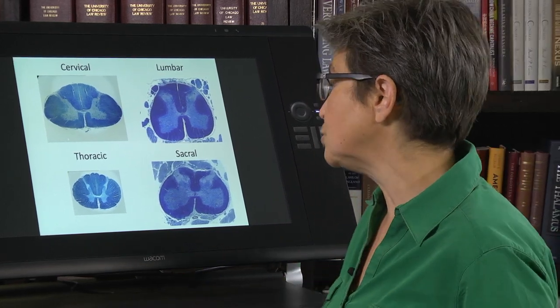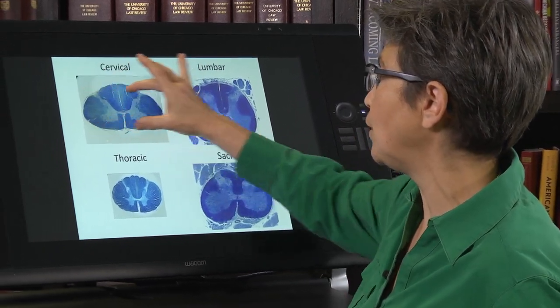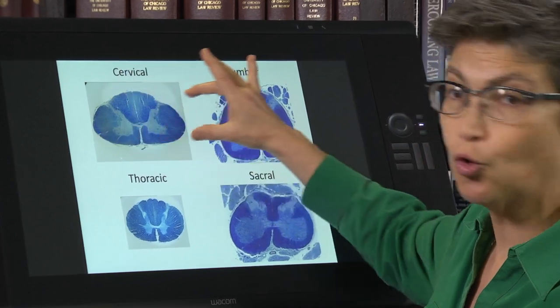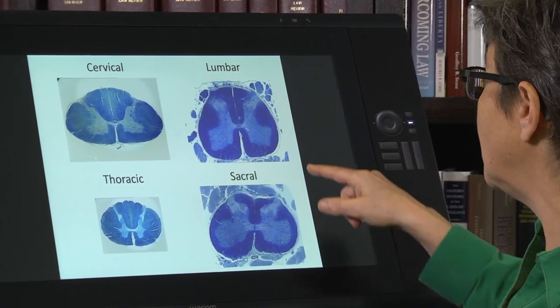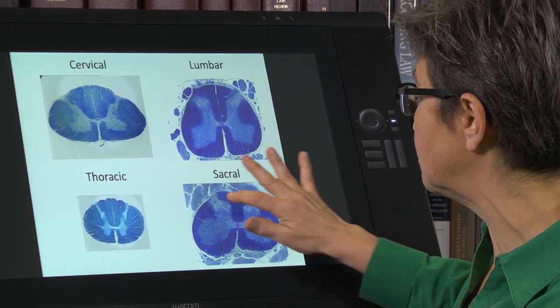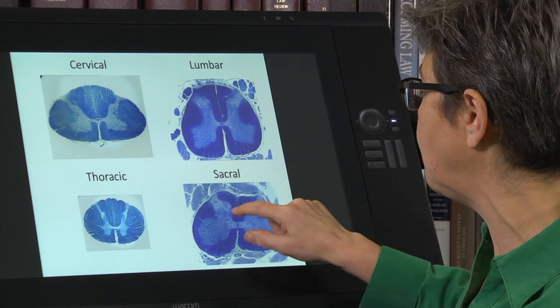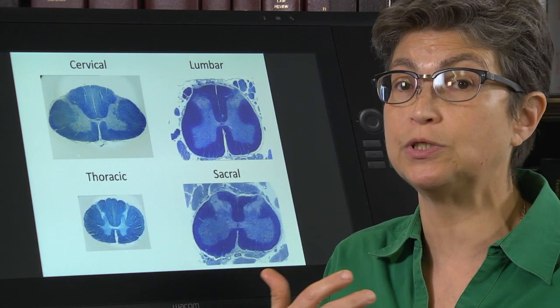There are other features. So the ovaloid shape of the cervical cord is quite distinctive. The square shape of the lumbar cord, the round sort of almost teardrop shape of the sacral cord, and the round shape of the thoracic cord, these are all somewhat distinctive.